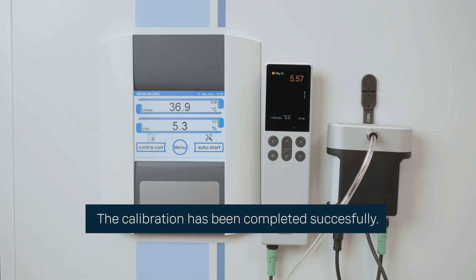Now the calibration is completed successfully. I hope this video was useful for you. Remember that Vaisala is your calibration expert. Please contact us for calibration services at vaisala.com.